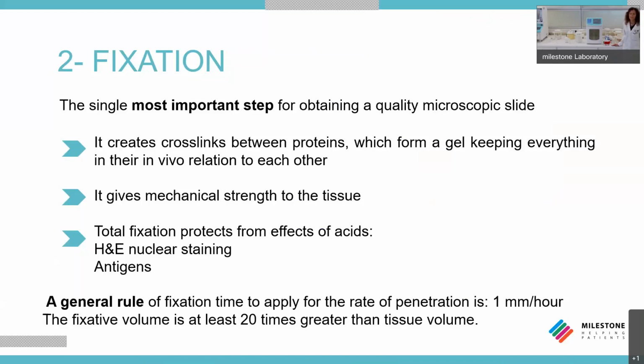So, before starting the decalcification, dehydration, clearing step, tissue must be correctly fixed. A general rule of fixation time to apply for the rate of penetration is 1 millimeter per hour, and the fixative volume is at least 20 times greater than the tissue volume.